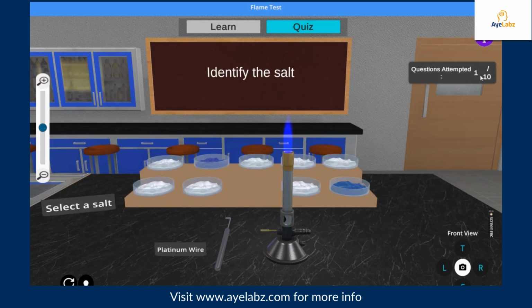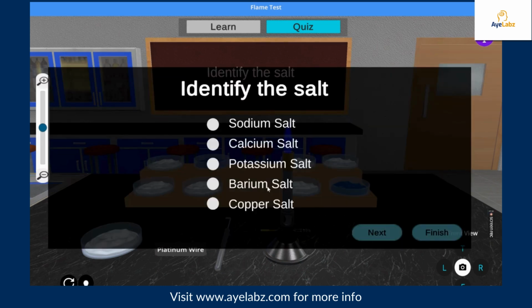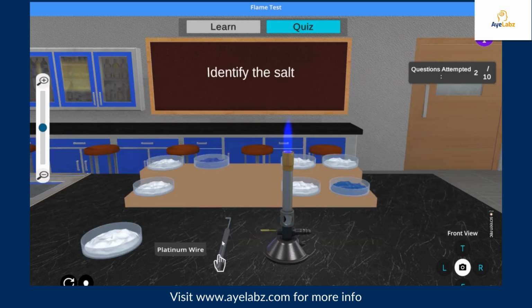You can see the question attempted is now 1 out of 10. Let me pick up another salt and do the experiment again. Again a shade of green. It must be barium. Let me pick up some other salt.